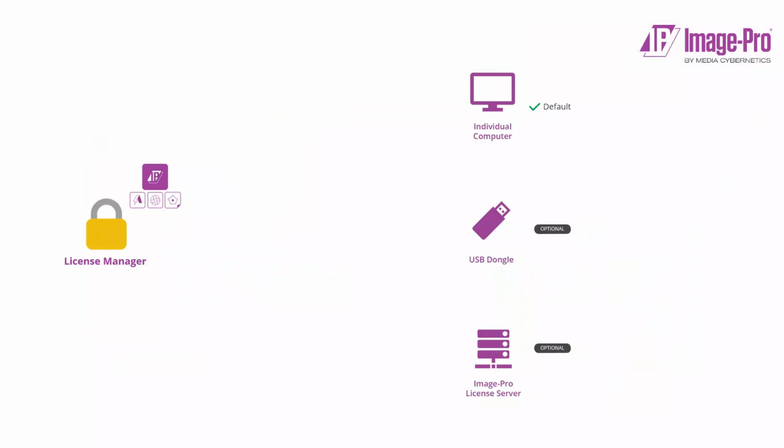License bundles can be linked to computers, dongles, or the license server using the License Manager. When a bundle is linked to a computer, all users of that computer are licensed to work with Image-Pro. License bundles can be unlinked at any time using the License Manager and relinked to another valid target.